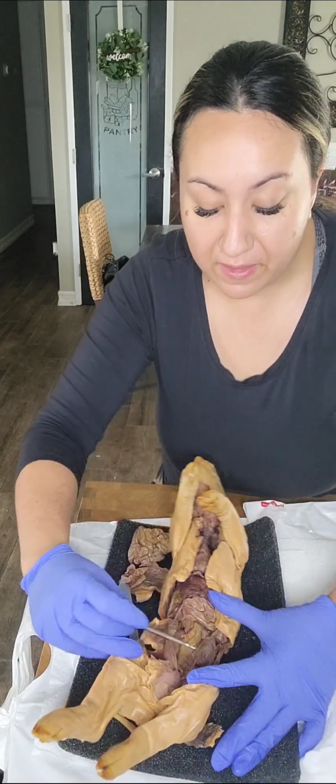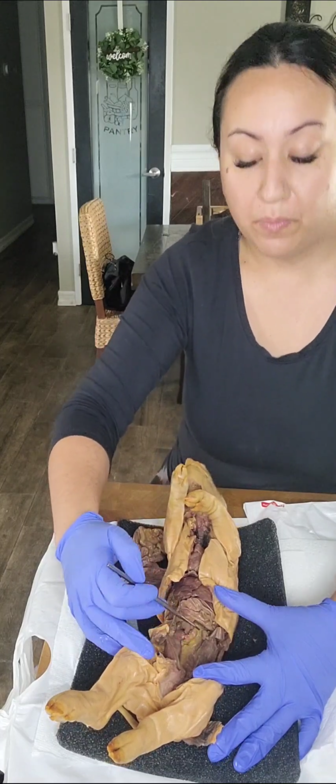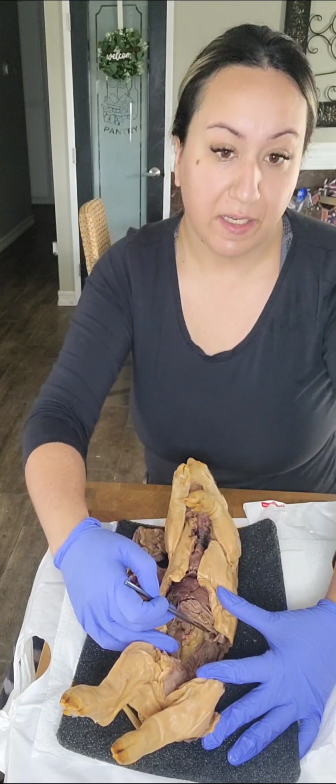As you can see here, we have our kidneys. We have our right kidney here. We have our left kidney. And it also shows up on top. You can see it more prominent on our left kidney. You can see the adrenal gland. It is still attached to our kidney here.